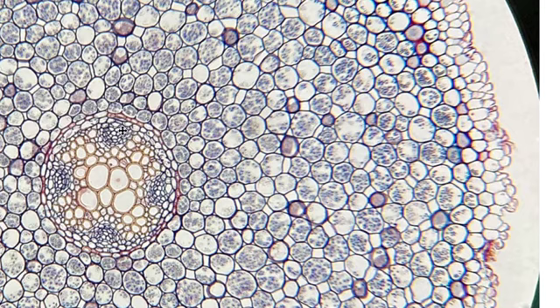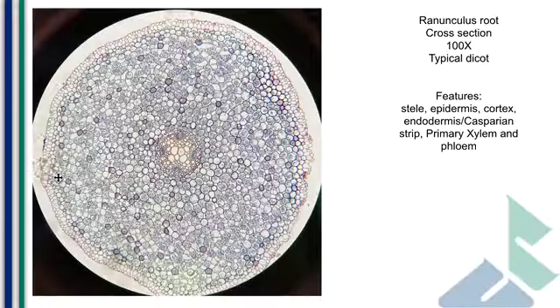And same goes with our phloem, colored in teal here, or slightly blue, I suppose. These tissue layers that are going to be transporting our sugars. And so there you have it, the different pieces of our ranunculus, or buttercup root, visualized at 100x.